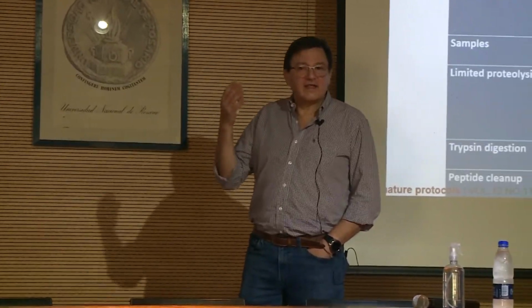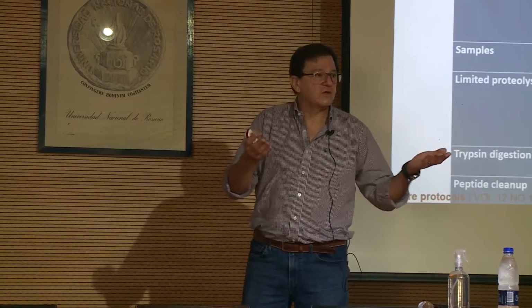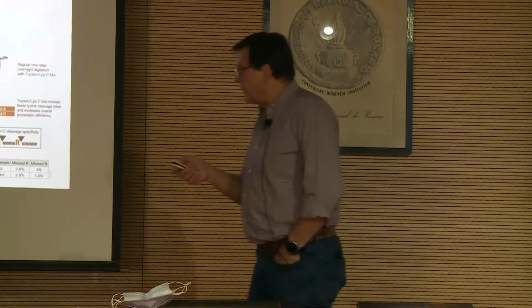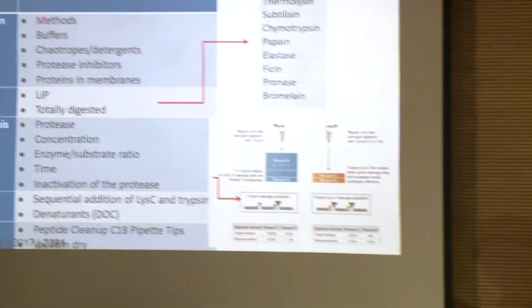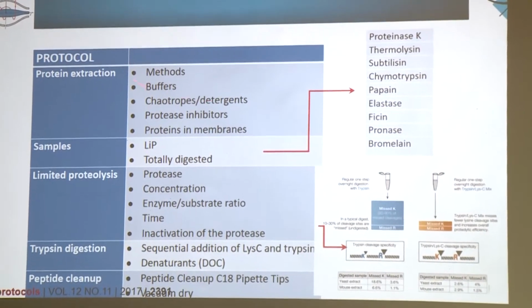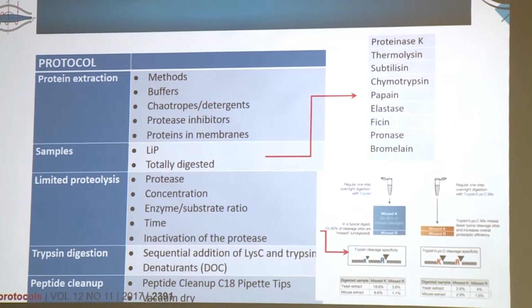The authors are not trying to replace another methodology, it's a complementation, trying to get new information. So you have to define very well the buffers and the environment in which you lyse your cells.